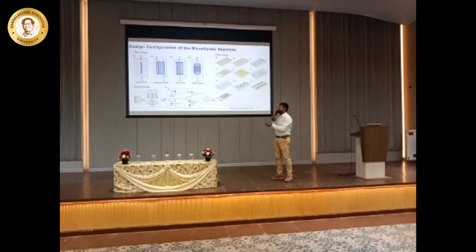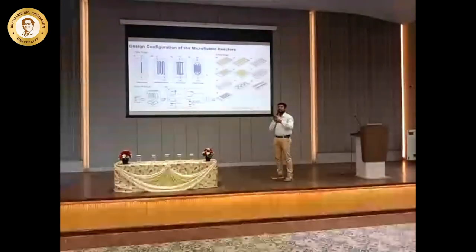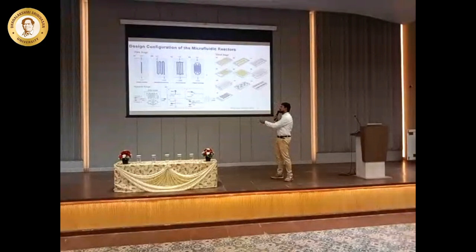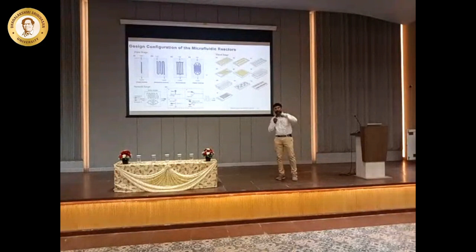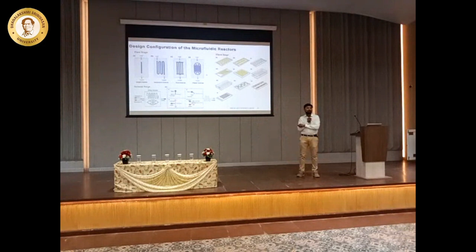So now if I make a droplet that can travel across these serpentine structures, I can make my droplets mix much more rapidly when compared to a normal fluid that's going to flow through these serpentine structures. Excellent, right? You understand, you in a ball, like when you go to theme parks, you travel like this, right? What is that? I didn't recognize. So what happens is there is a rapid mixing. Some people will vomit. It's because there is a mixing that's happening within your body, right? The same thing will also happen within these microchannels, right?